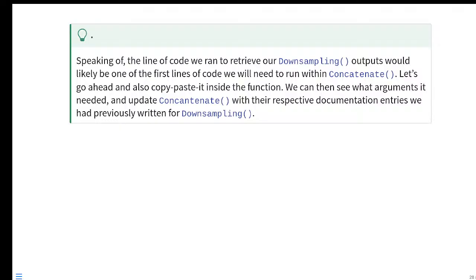And then, as far as the Auroras, your question is, can you combine data from both the conventional and spectral mode for Aurora? They are saved in slightly different ways internally for the FCS file, which is going to be the complicated factor. But if you're trying to merge them after the fact, you could basically do the same thing as with your spectral flow cytometry file. You could just downsample, and select the equivalent columns that would have been the channel markers for the conventional file, and then try to combine those two.